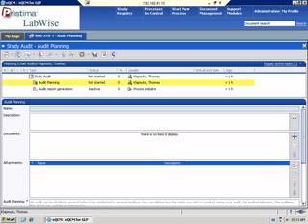And so here you would give your audit a name. So we'll call this study (1401) audit, and the description is, and again, these are all free text fields, whatever description you want to put in. It'll include the protocol, day 0, activities, data tables, and reports.